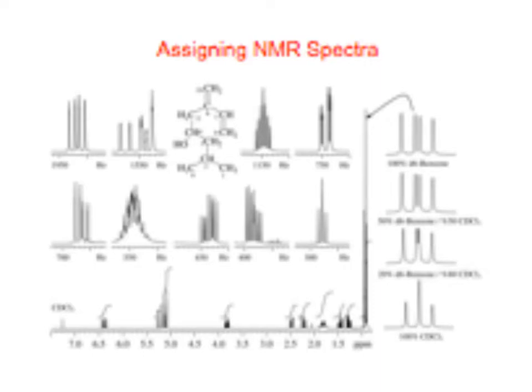Yeah, but it's just a carbon chain, right? Usually when we see an isopropyl like this, those methyl groups are the same. Why is it in this case they're different? It's a solvent? No, the solvent changes their chemical shifts, and just luckily, by adding some benzene, they move apart. You can't really predict that, but you can try some different solvents sometimes, and they'll move things around a little bit, and sometimes they'll be apart, sometimes they'll be right on top of each other.